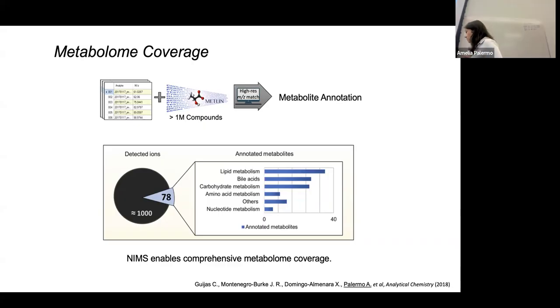So generally, in this type of study, when some metabolites are changing and are interesting, they are charted through mass spec imaging, but their identity is confirmed by selective sampling of parts of the sample and then submitting them to classic in bulk measurements.